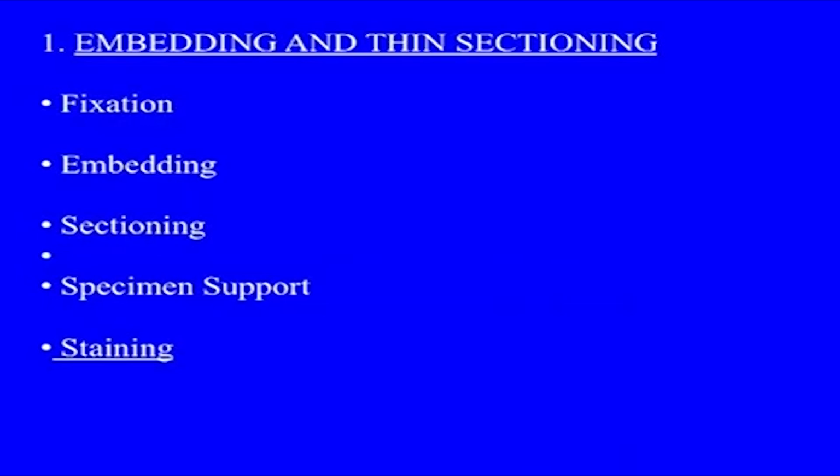As we go along, we will discuss various ways to create contrast. So, let us see the first method. Now, if you could recall, the specimen preparation in light microscopy involved fixation, dehydration, embedding and sectioning, and likewise here also we follow the same steps, but with certain differences.